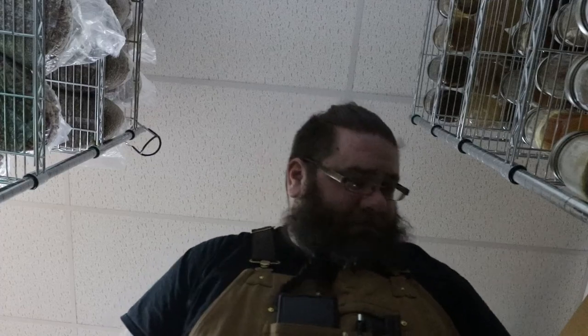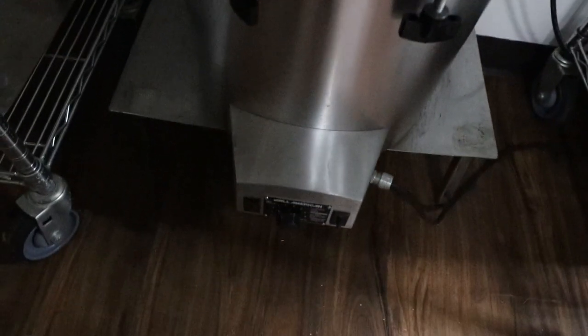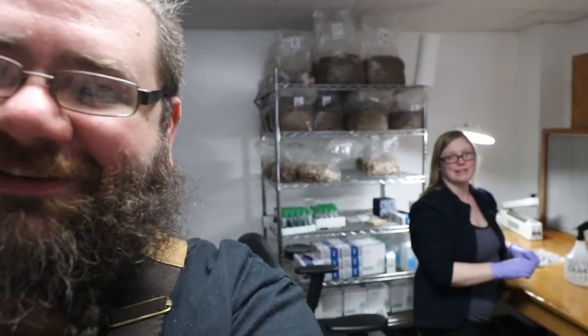Yeah, since we're in the lab, let's talk sterilizers. Sterilizers, much like the All-American here. Again, it's the 75X model. I'm just gonna put you back on the tripod. That's cruel. I told him not to put you in there. Yeah, she said, don't cook our audience.